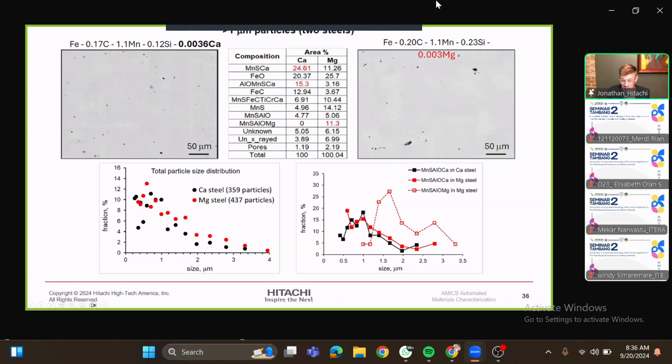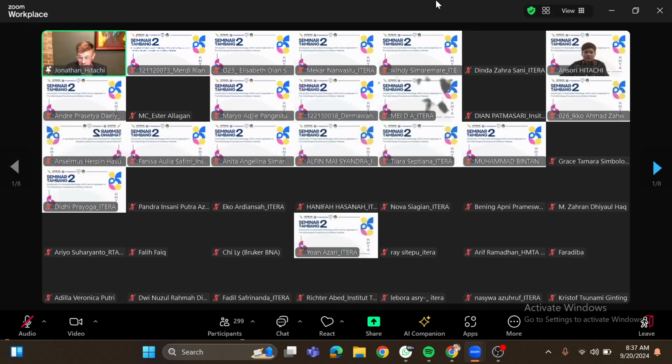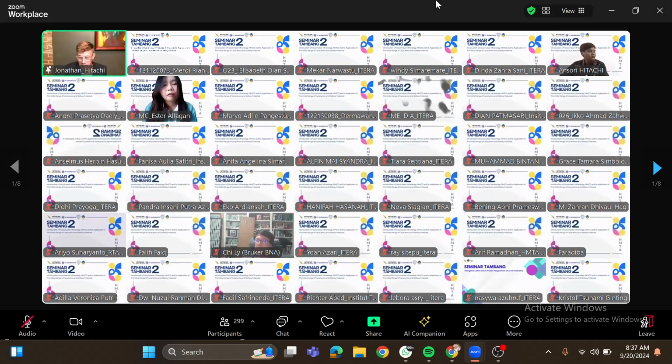We're going to talk about drilling, but I just wanted to give a quick preview here. Here is our drilling. When we drill down, the material is going to come to the surface, and the scanning electron microscope is our only opportunity to have real quantitative data from the surface. So I'm going to stop sharing. I hope that I didn't scare everyone. And I'm going to hand it over to my colleague.